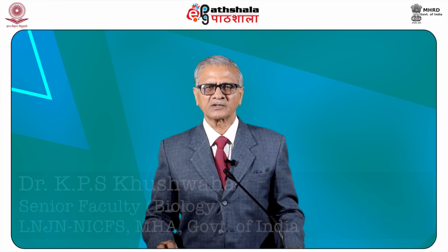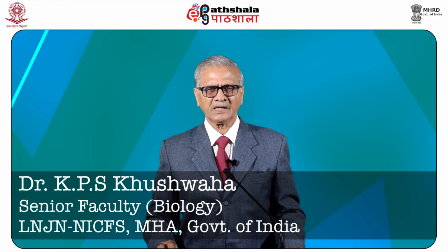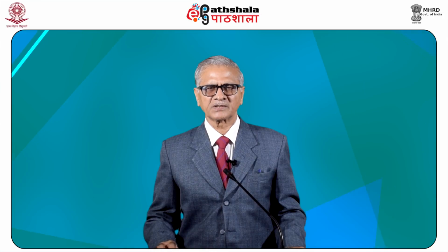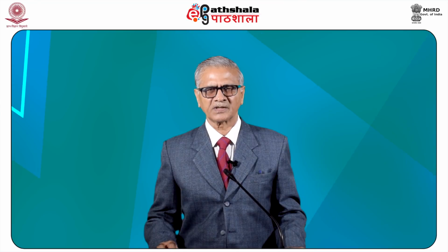Friends, in this module of PCR failures and case studies, I shall discuss what is polymerase chain reaction, what is PCR technology, common reasons of PCR failures, solutions for PCR inhibition, and case studies related to PCR failures.